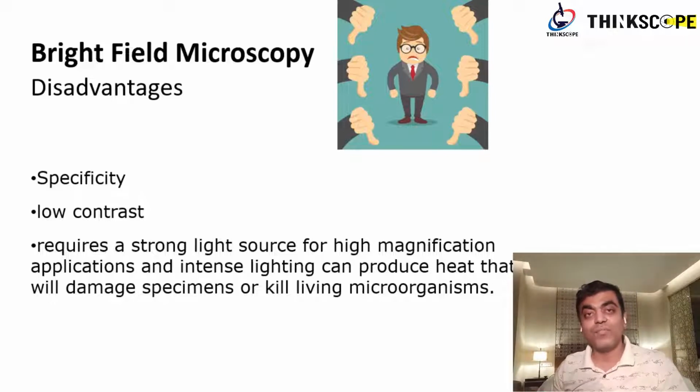Obviously you're using a strong light source, so at times your sample may not like it. Even if you're working with live cell lines, your sample may not like a brighter light. So in those scenarios, it's a no for Brightfield. But of course we have other techniques which we are going to discuss in later sessions.